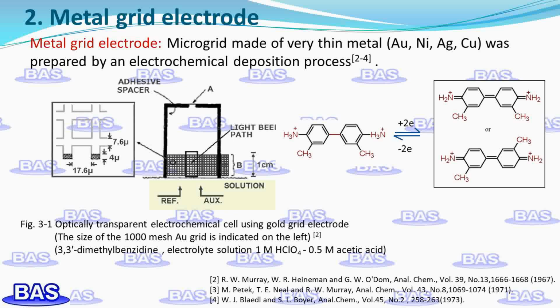The micromesh is sandwiched between two pieces of glass or quartz glass. Each piece is spaced with a narrow strip of adhesive, at the thick black line, applied around its perimeter and bonded with moderate pressure. Then apply a generous amount of adhesive to the edge of the clip to ensure a tight seal and place it in a dry place to dry for a period of time before use.